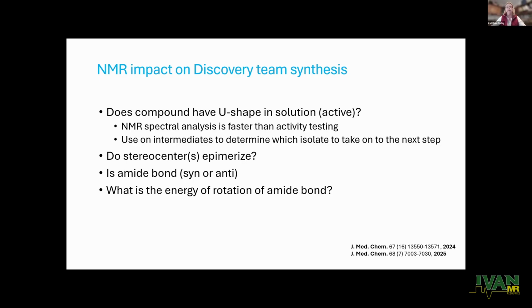Otherwise, it's going to give you false SAR results. You're going to think something is not active when really it's just epimerized, and that's the reason for the lowered activity. And we'll show you here in a minute, at least for this compound, it was very important if the amide bond was syn or anti. And also this amide bond, what was its energy of rotation?